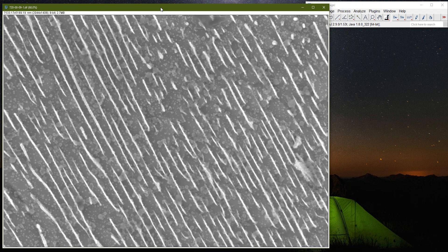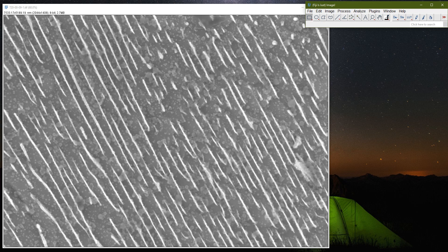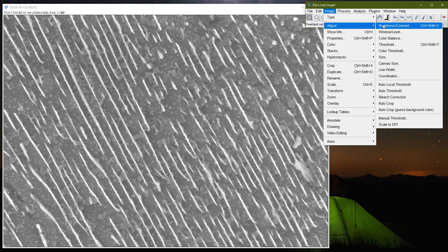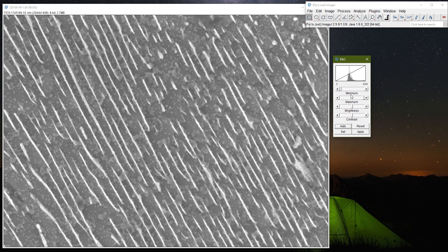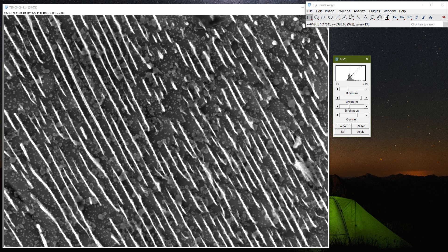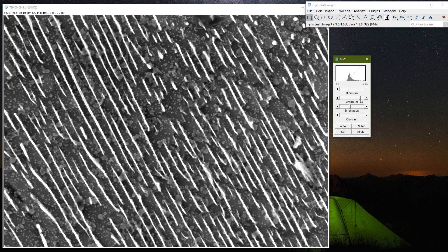Now I have the image at a larger size and I will work on it. The first thing I want to do is convert it to 8-bit — just in case, I'll click it to make sure it is in grayscale. Next, I want to adjust the brightness and contrast. I can see the histogram of the image and I'll move the sliders to adjust it, removing the last few areas. The image transforms significantly and I can now see the cementite lamella more clearly — they appear much whiter while the other areas are gray. Once set, I press Apply and click OK.